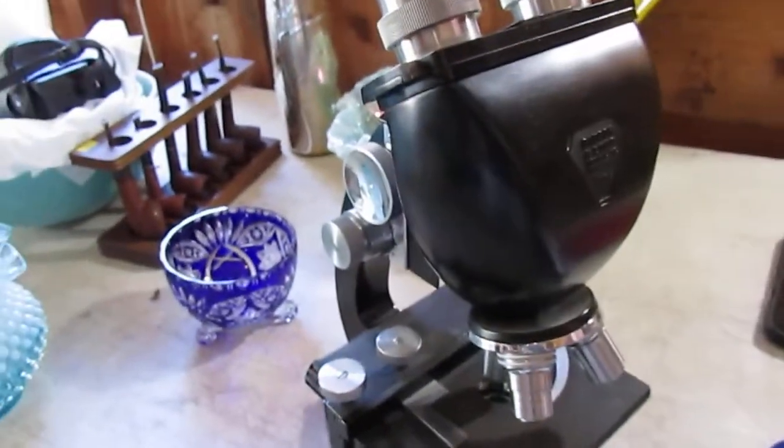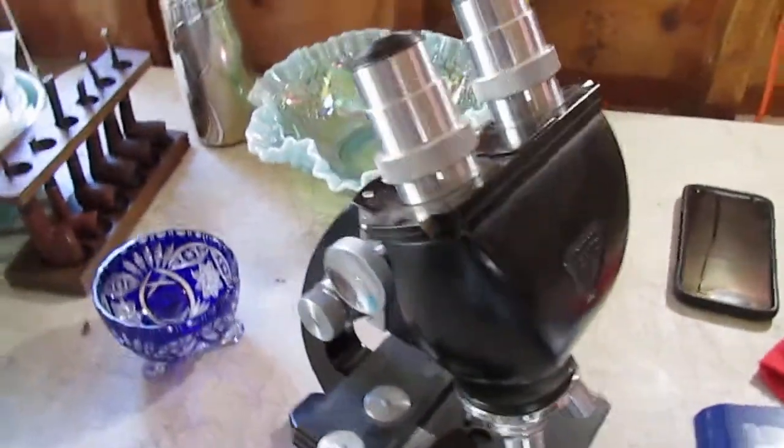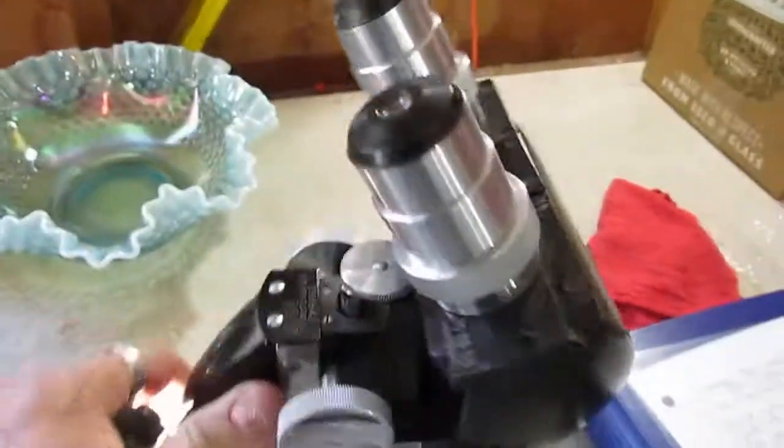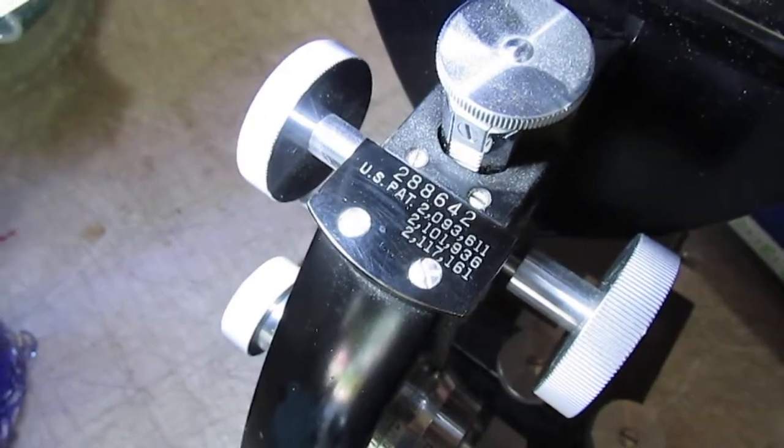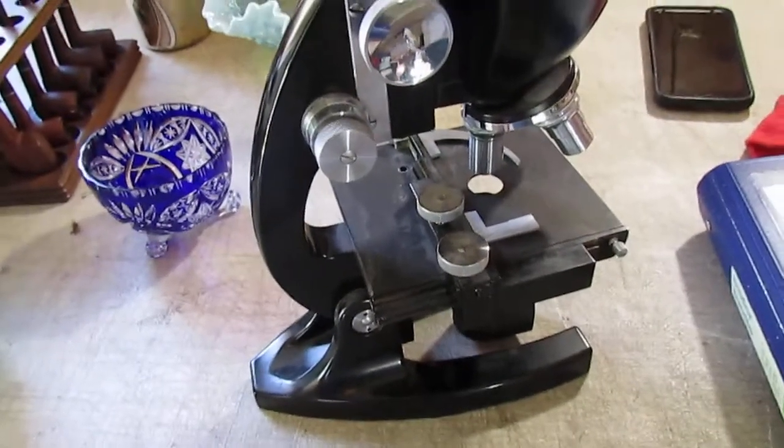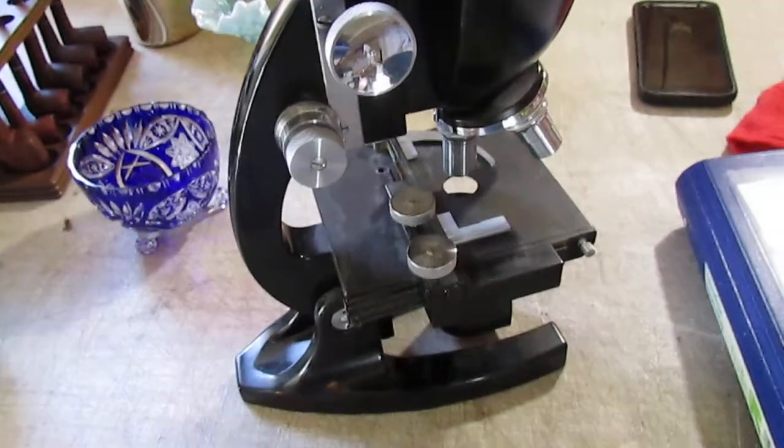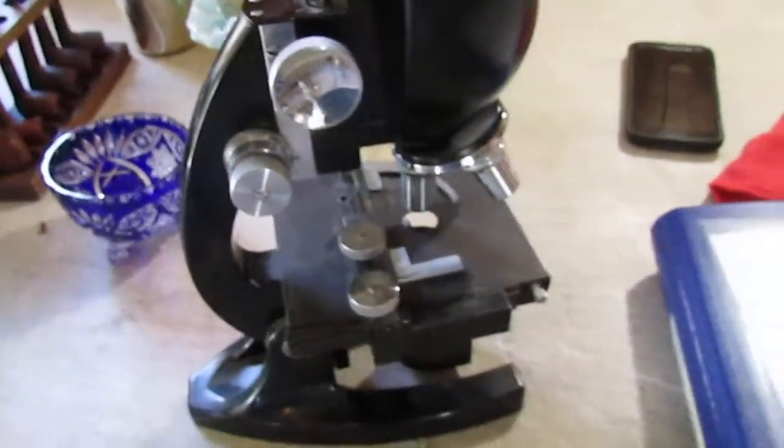We honestly don't know exactly what model this is. There is a serial number up top, right there, but we can't find any information on that. The base underneath is also stamped, but that really didn't provide any information either.